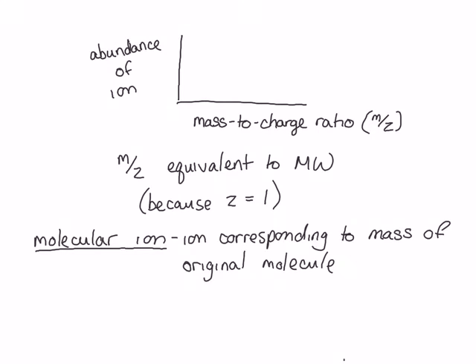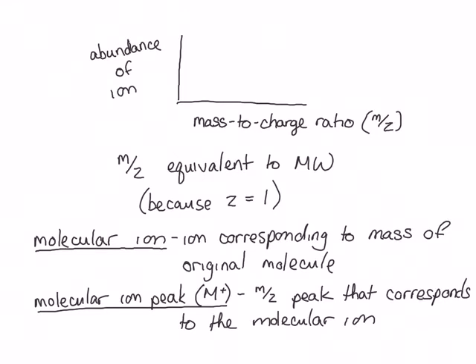And we're looking for the molecular ion peak in the mass spectrum. This is the m/z, or mass-to-charge peak, that corresponds to the molecular ion. This is usually the peak with the highest mass, not the peak of highest intensity. The other peaks at smaller mass-to-charge ratios are due to other fragments, and we're not going to worry about these. Let's look at some example spectra.